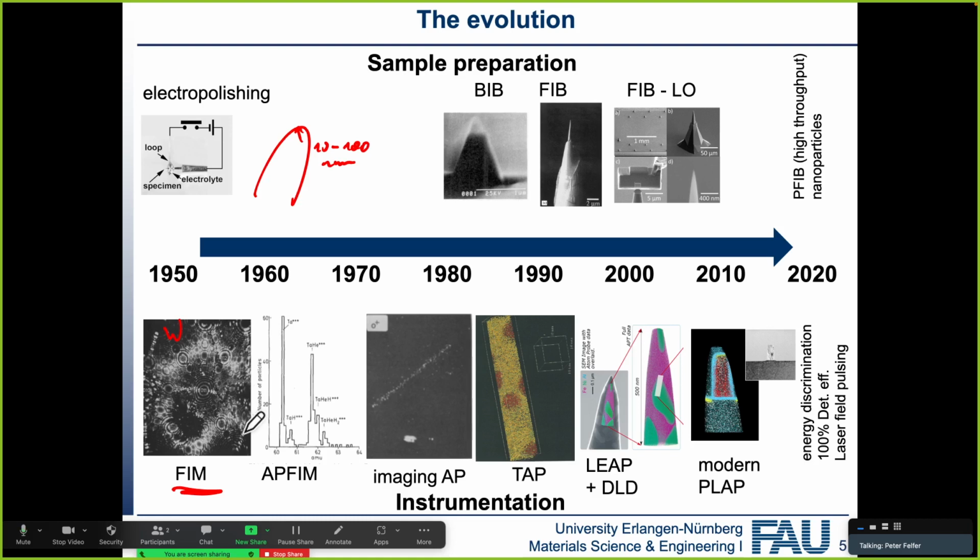They're all tungsten. But as soon as you start having things like, in this case, a grain boundary, and if you're a professional atom prober, you already see that here there's some kind of defect, essentially a grain boundary. So probably all of you know what a coincidence site lattice is, from your basic crystallography lectures. And that was discovered exactly like that.